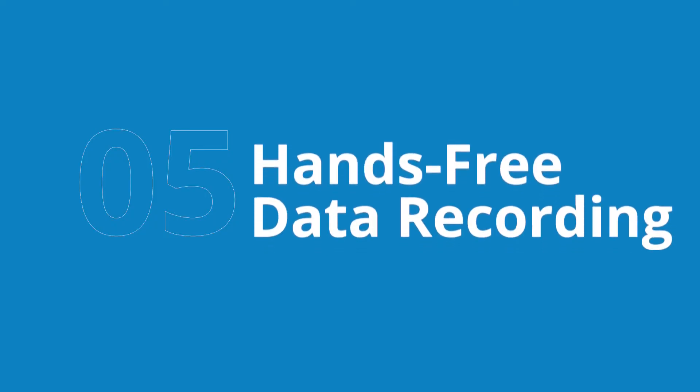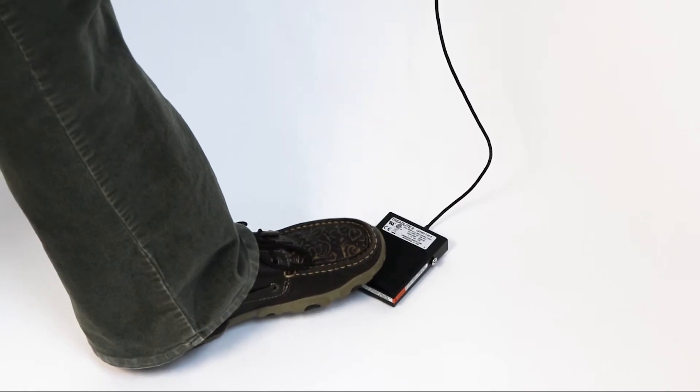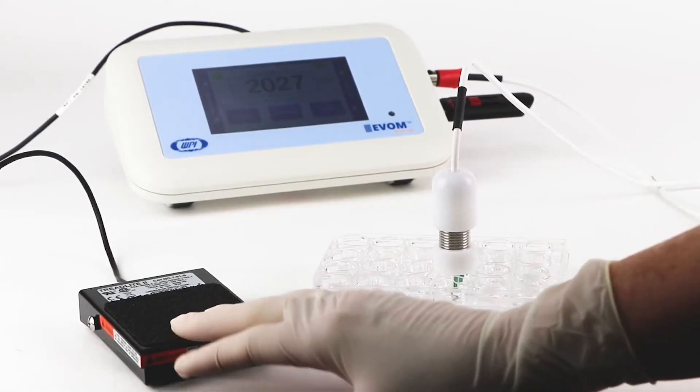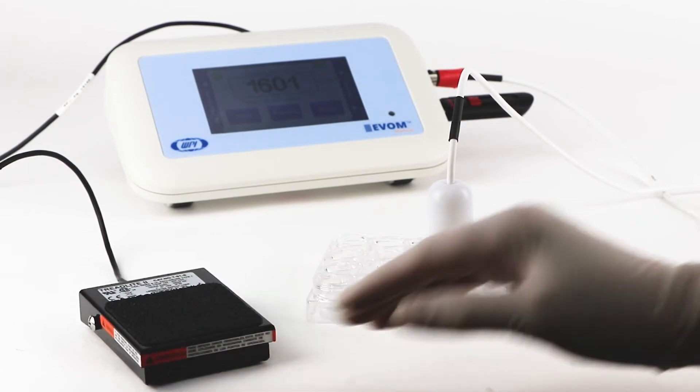Fifth, further streamline your process and use the foot switch for hands-free recording. With a foot switch, you don't need to touch the EVAM Meter, which means there is less chance of contamination. And since data is recorded automatically when you tap the foot switch, you also don't need to move in and out of the hood to make notes.